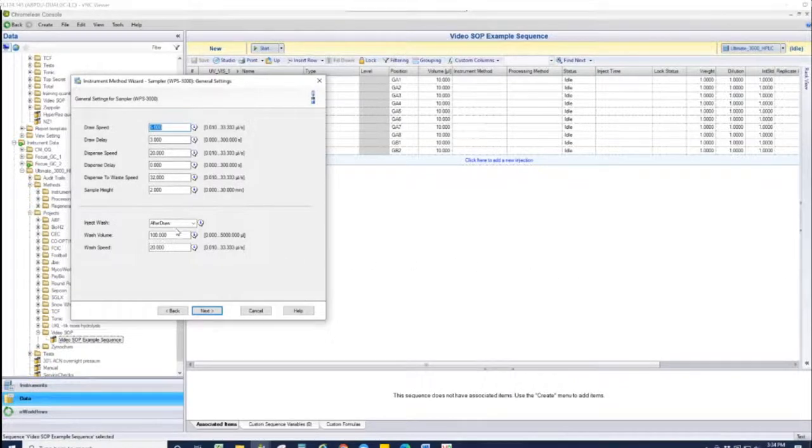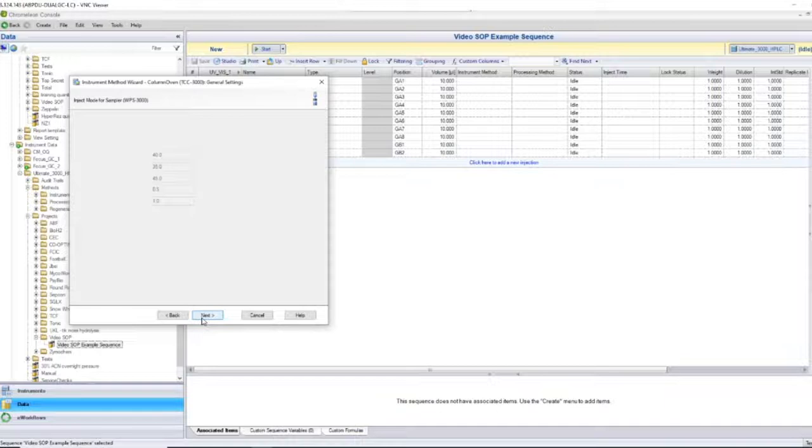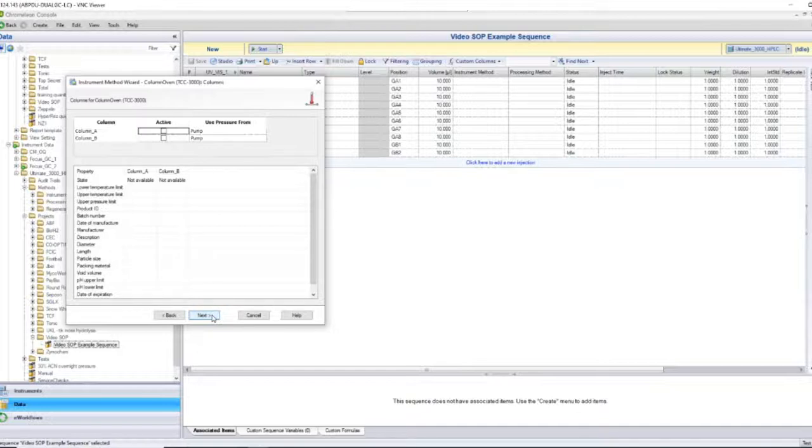Select Next, and you will be brought to the sampler settings page. You can leave this window as is unless you have any reason to change any of the parameters. Select Next, and you will be brought to the injection mode for the sampler. Again, you can leave this window as is unless you have a reason to change any of the parameters. Select Next, and you will be brought to the column oven settings. Select Use Temperature Control and set the temperature, lower limit, and upper limit. Select Next, and you will be brought to the column settings. You can usually leave this window as is unless you have a reason to change any of the parameters.